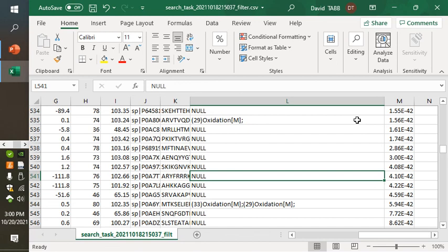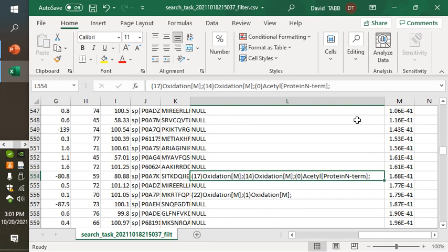I think it's reasonable to assume that for most search databases of 6,000 or fewer proteins, a given raw file is going to take less than an hour to search. In this case, I had 6 raw files searched against a database of 2,000 some entries, and I believe all of it was done in a couple hours, if I remember correctly.